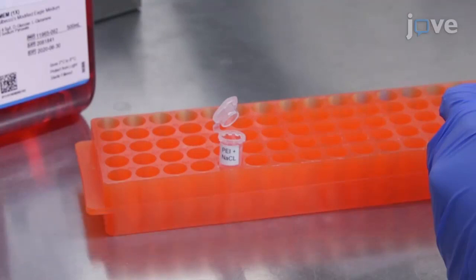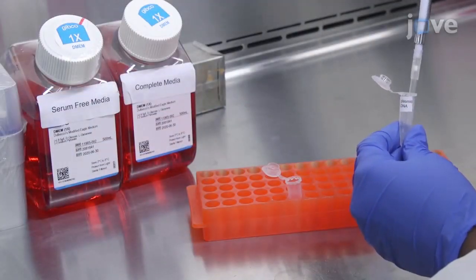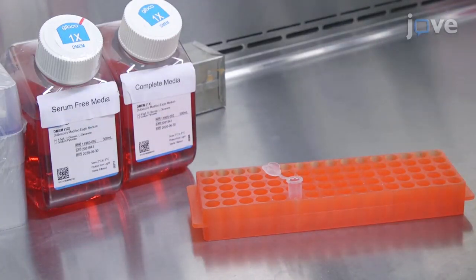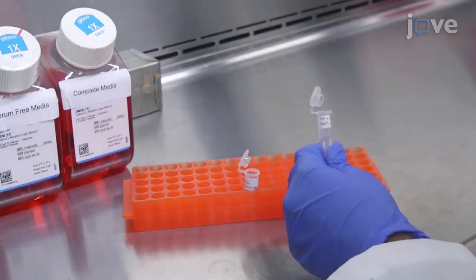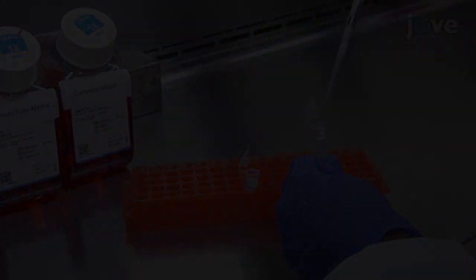Next, combine three micrograms of plasmid DNA with 100 microliters of 25 millimolar sodium chloride per culture well for a five-minute incubation at 37 degrees Celsius. At the end of the incubations, combine the entire volume of each diluted PEI reagent with each diluted plasmid.